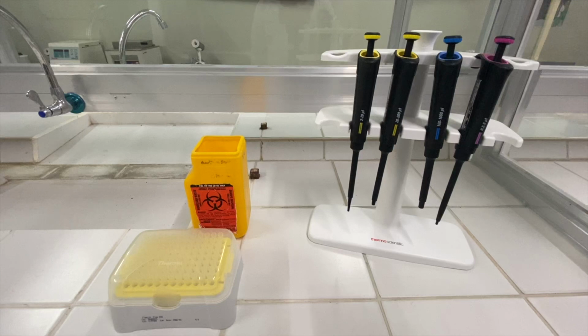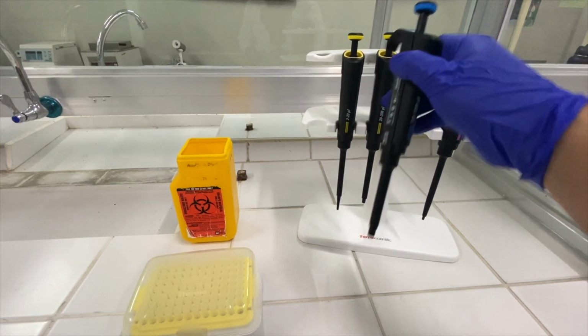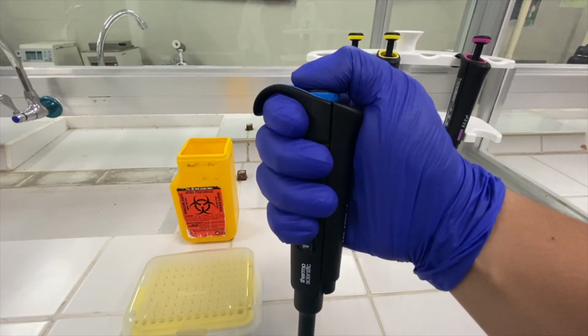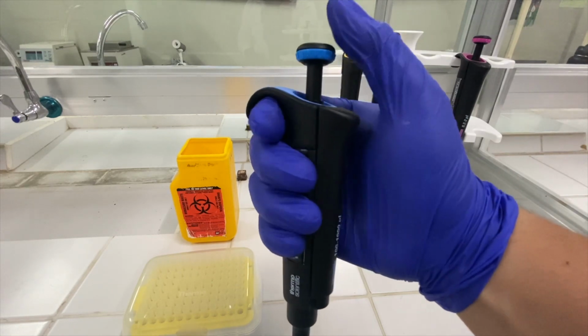So next, it is important to know the difference between the first stop and the second stop, as this will determine the pipetting technique you are performing. The first stop is the first resistance you feel when pressing the plunger. Pressing it down further, that is the second stop.